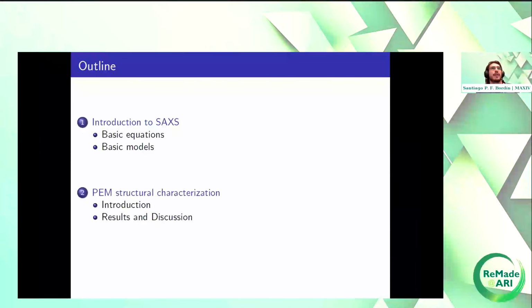I divided the talk in two parts. At the beginning, we'll introduce the technique for who doesn't know about. I will talk about basic equation and some models that are used to analyze the data. And then I will comment the proper research that is in proton exchange membrane. I give a brief introduction about this material, and then we will discuss some results.